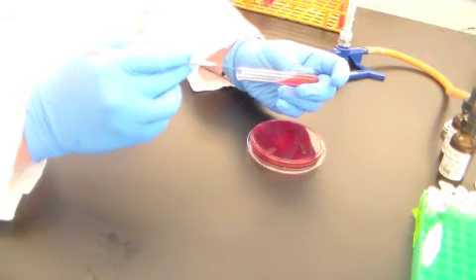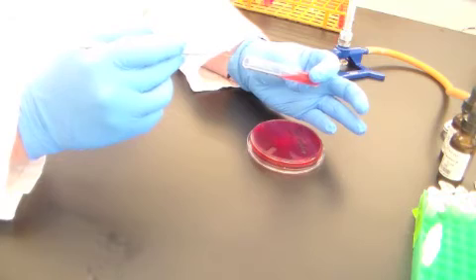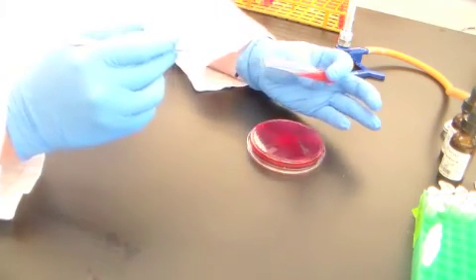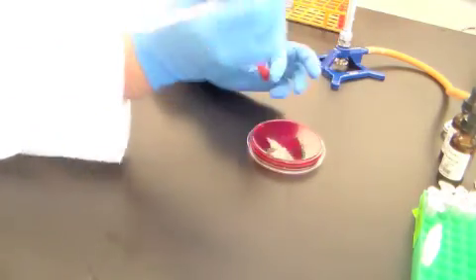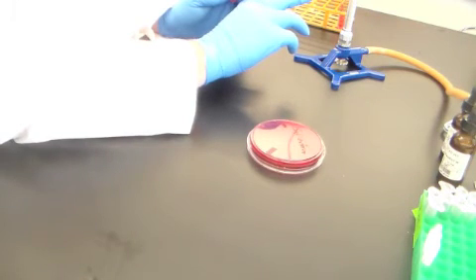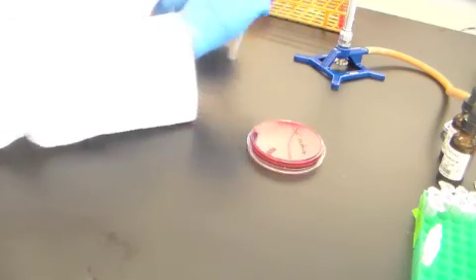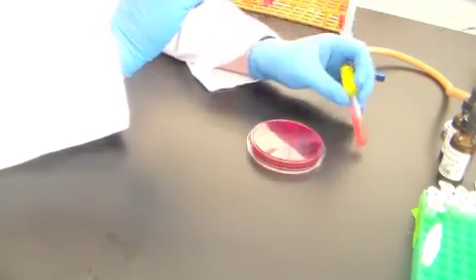And then I'm going to stab down all the way to the bottom of the tube, at least once. Sometimes you may want to do it a second time. Pass that through the flame again, recap the tube, sterilize your loop, your needle. Label this culture, and it goes into the incubator.